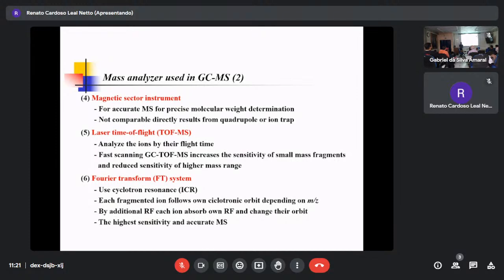Understand? So that's why you have heard it many times, HRMS. What is your HRMS? In your lab, which kind of HRMS do you have? Excellent. It is a Q-TOF, right? So they said it's a Q-TOF. Then you can understand. Quadrupole TOF, so there are two analyzers.